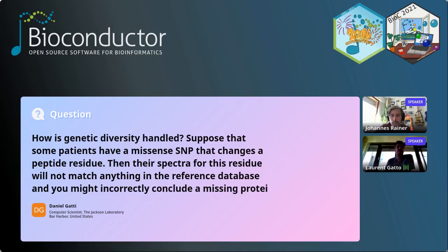And so, as I mentioned before, these peptide identifications, with or without modifications, could then be attached to your raw data that is stored in a Spectra object. The package that handles these identification data is called PSM. It's not on Bioconductor, but you'll find it on the R for mass spectrometry GitHub organization.